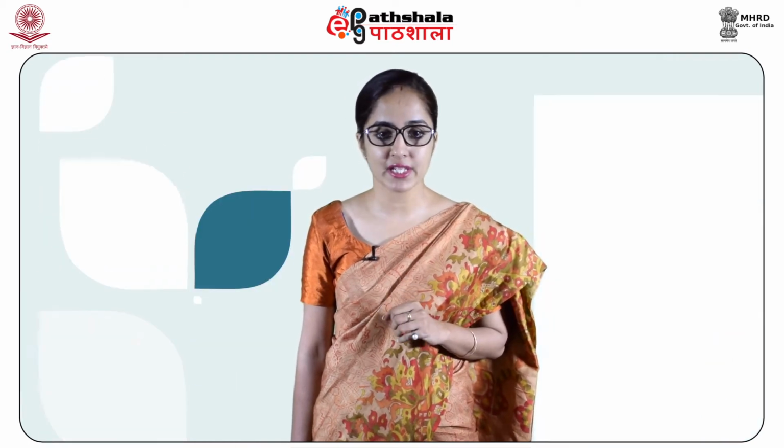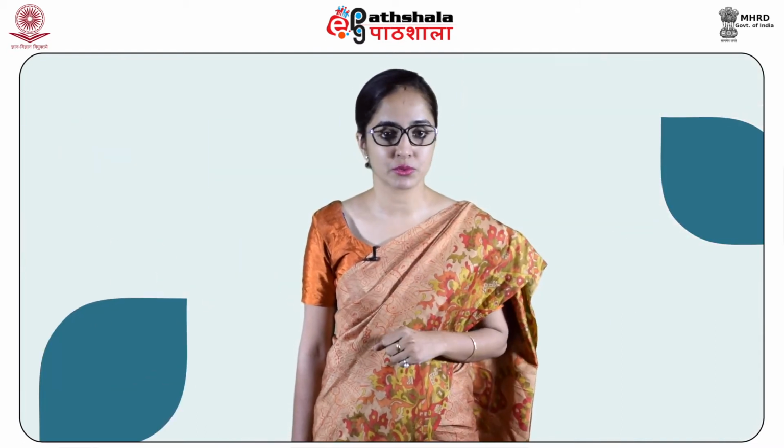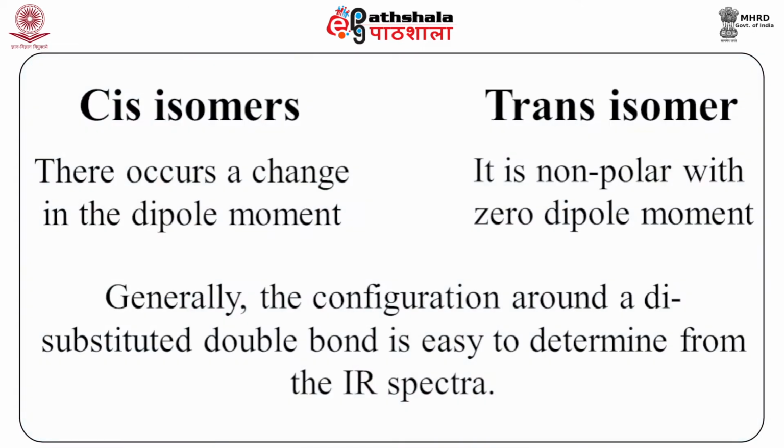By using this fact, students, we can distinguish between cis and trans isomers using IR spectroscopy. In cis isomers, there occurs a change in the dipole moment, whereas trans isomers are nonpolar with zero dipole moment. Generally, the configuration around a disubstituted double bond is easy to determine from the IR spectra.